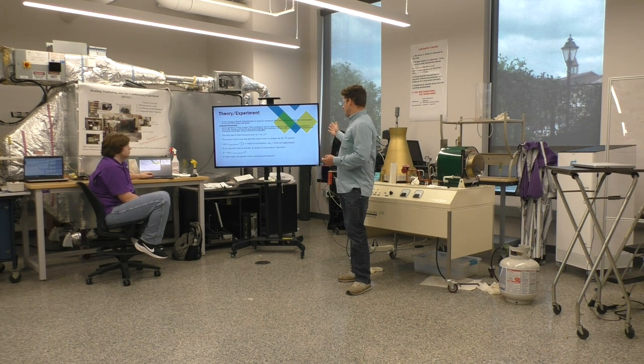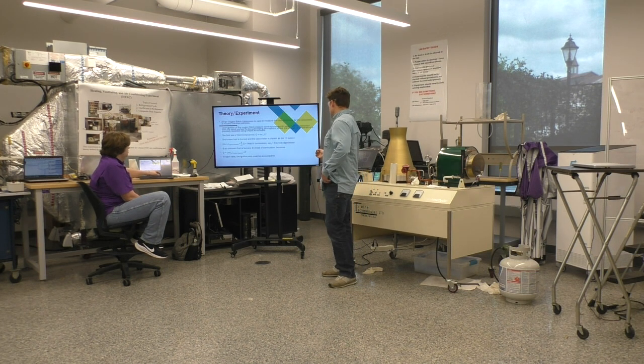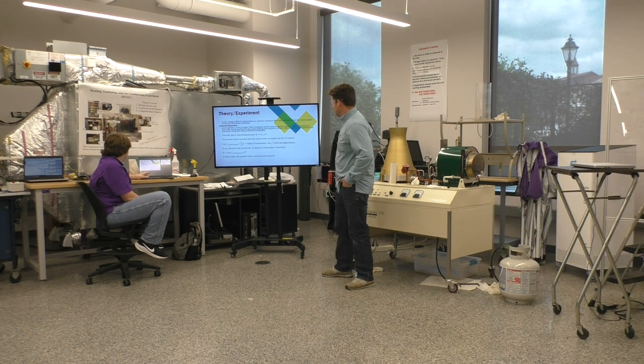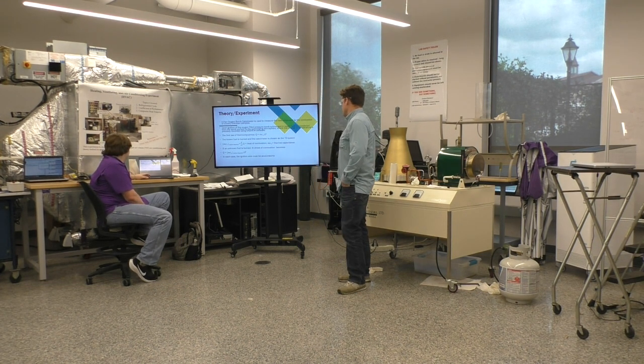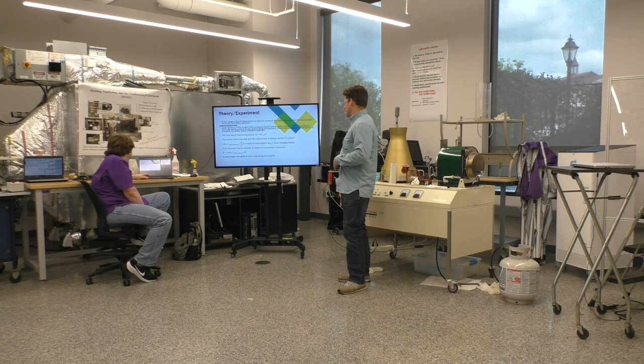Quick overview: first law of thermo, our heat gain is equal to our thermal capacitance times our delta in temperature. So, our known fuel is going to be burned, and the calorimeter is going to be chosen as the thermodynamic system. In order to find the heat gain, we do some algebra, and we'll find the total heat of combustion, and we can transfer that into, say, calories, so we have a calorie rating of the substance. And in each case, the ignition wire must be accounted for.